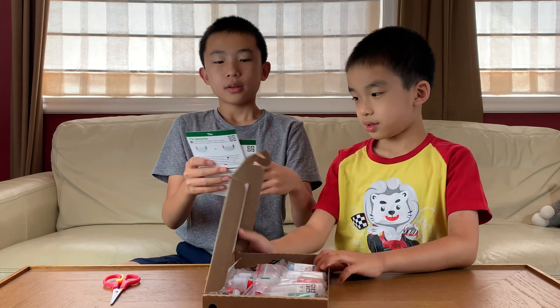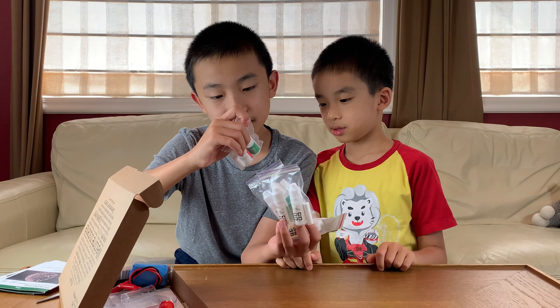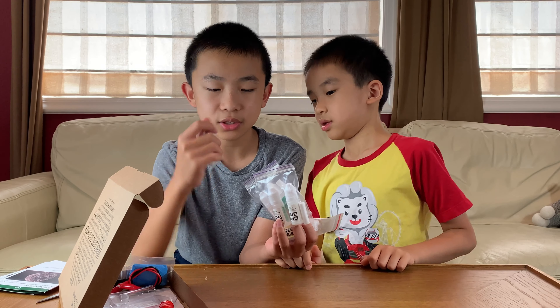Here are some bottles — there are so many bottles of weird stuff! There's tin chloride and sodium hydrogen sulfate in one bag. I think these three bags are the same. And in another bag there's zinc and liquid soap.